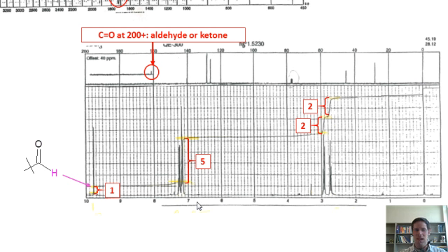Now for these examples and the vast majority of examples you'll ever encounter on a standardized exam, the NMR spectra that you'll get for an aromatic compound will only be for a substituted benzene. That's it. So don't worry about other aromatics like pyridine or imidazole or some other crazy aromatic. We'll just stick to benzene.